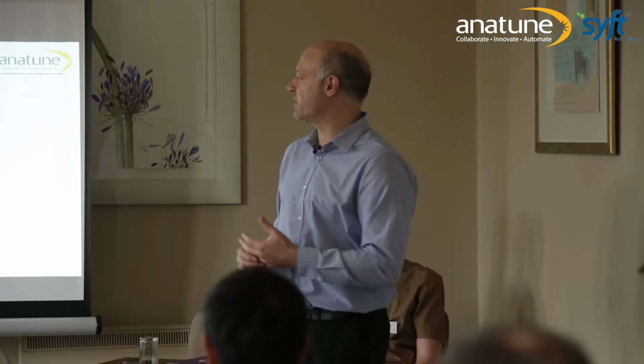you've got to do a method development before you can validate a method. So very broadly and quickly, just what is the difference between SIFT-MS method development and GC-MS method development?